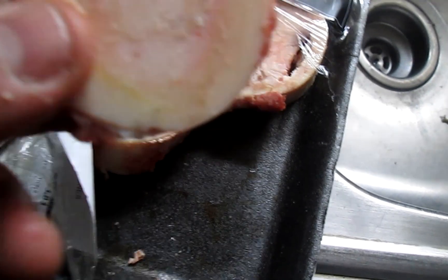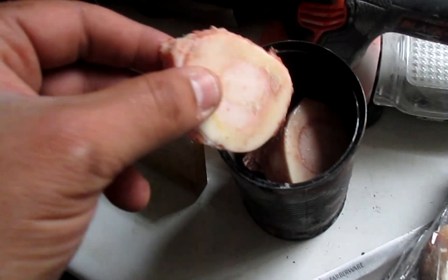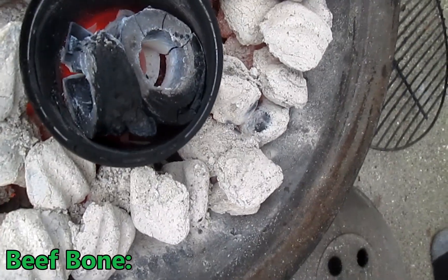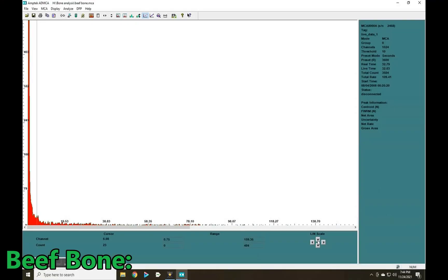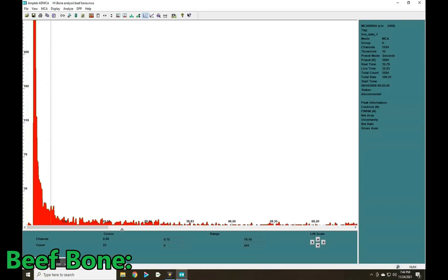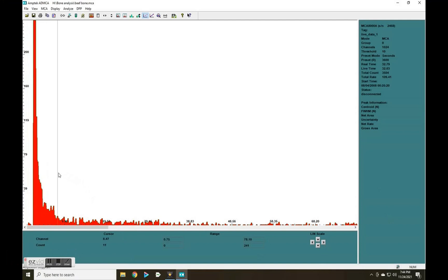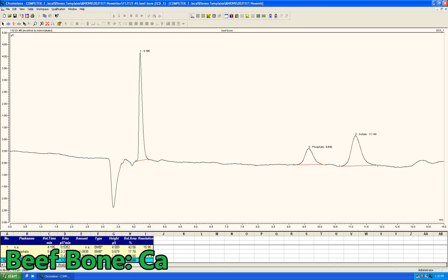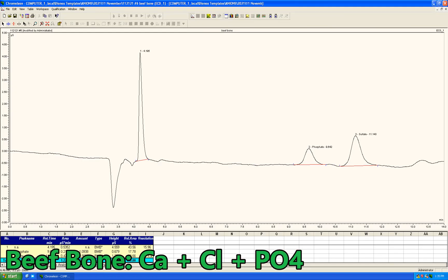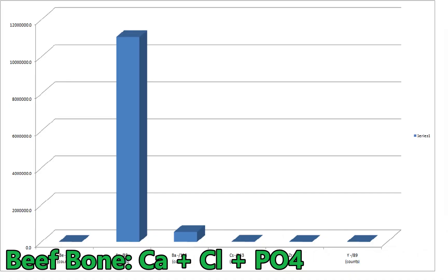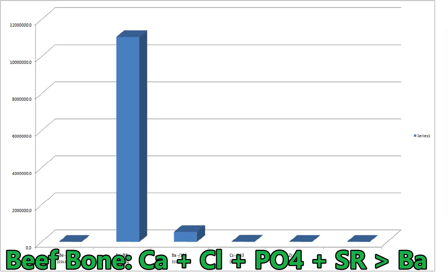Results like this demand actual beef bone analysis. Much like with bone ash, the XRF reveals mostly calcium, and the IC shows some chloride along with phosphate again. But this time, the mass spectrometer displays a higher concentration of strontium versus barium.